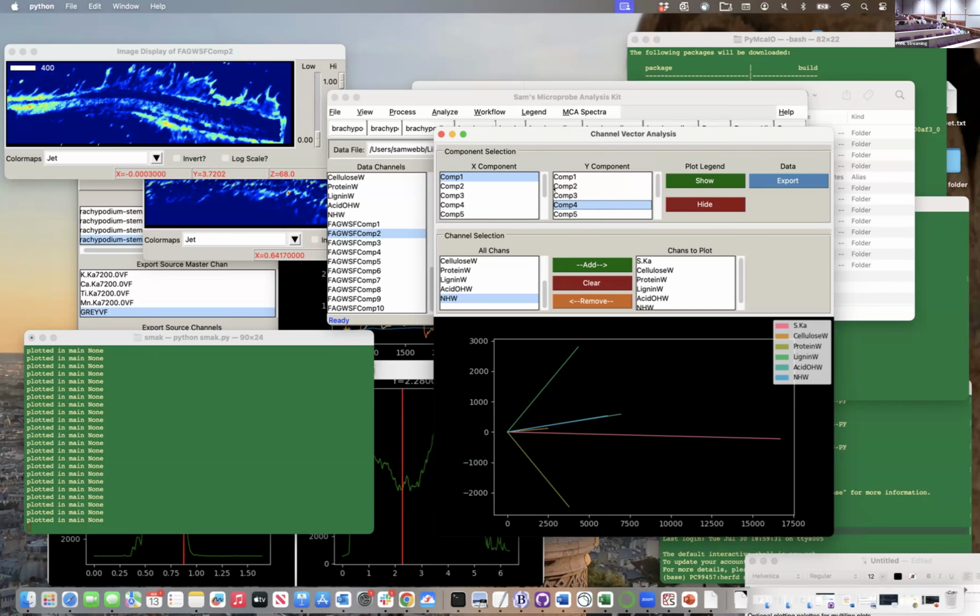So I took the stem and put it in what would make sense for our beamline, because I had a lot of these samples to get through and I wanted to make sure Sam had lots of nice data to share. And so I decided to rotate because I was thinking we will rotate the data in SMAK. Yeah, it worked fine. Yeah, it did.